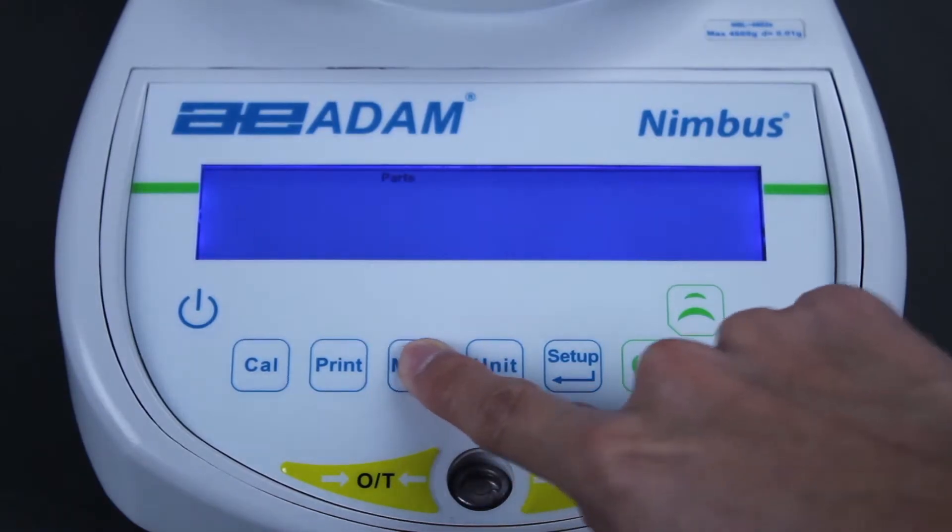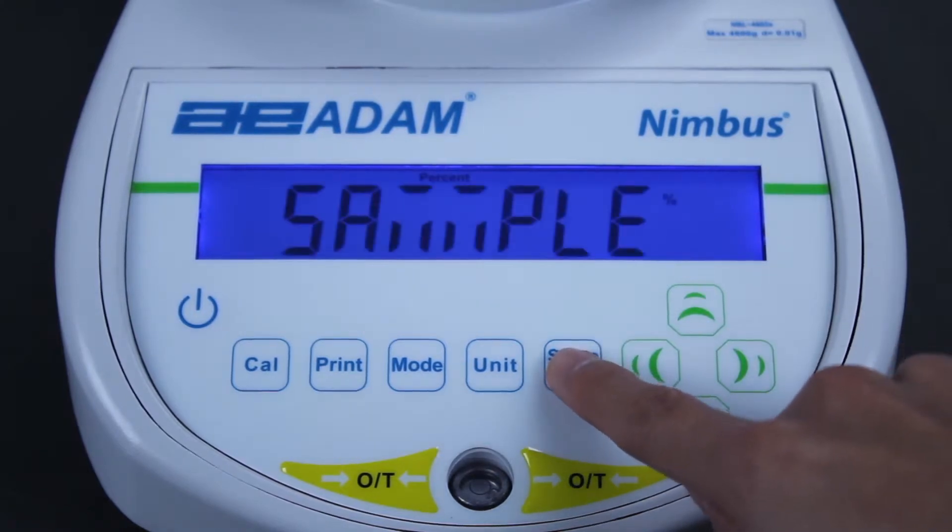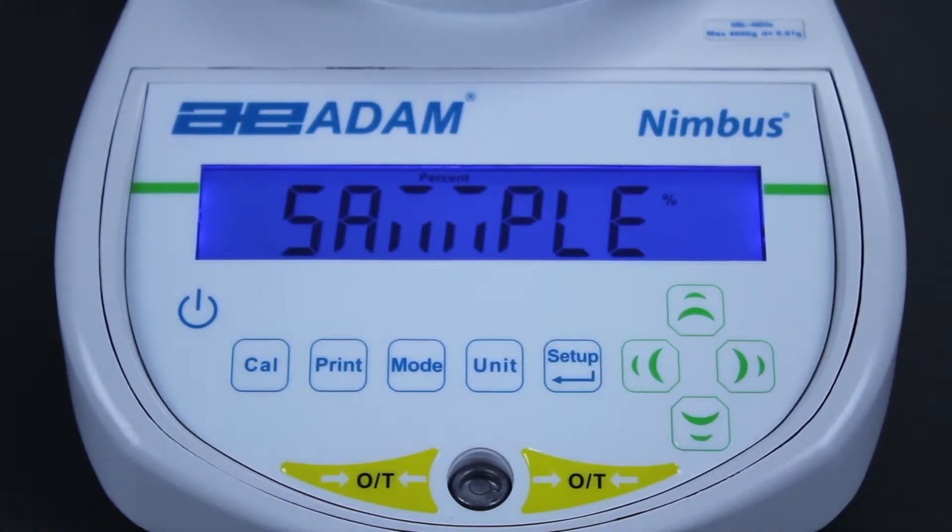Press the MODE key, then use the UP and DOWN keys to display PERCENT. When PERCENT is displayed, press the SETUP ENTER key.